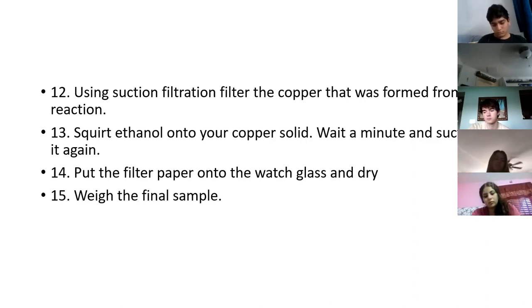You need energy to get that isopropanol into the air. That energy comes from the heat that your skin is making. Your heat goes away from your skin, it feels colder. So basically, I'm squirting ethanol on there to make sure that I get evaporation. The ethanol will dissolve any water. It evaporates the water that much quicker. So then I get the filter paper, dry it, and weigh it.